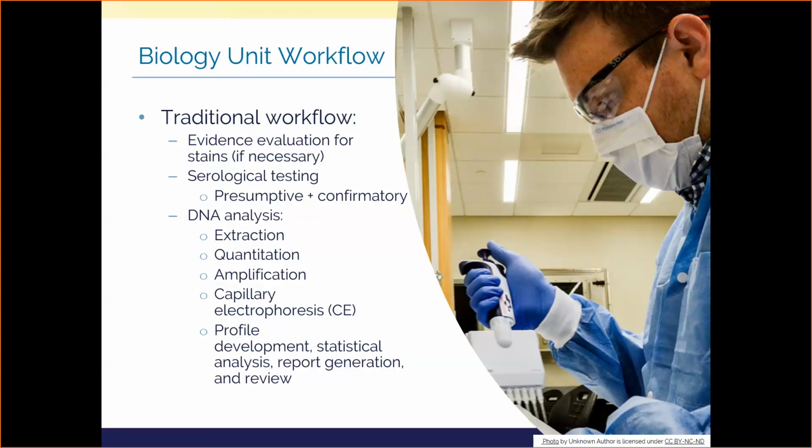Based on this example scenario, please recognize that discretion is perhaps the most important tool in our arsenal in the laboratory, and that we sometimes have to make tough choices on whether we can do any or perhaps only some of the tests you've requested for a given item.